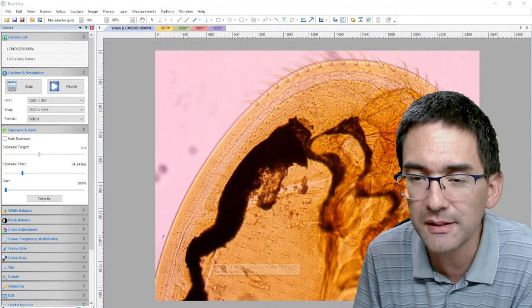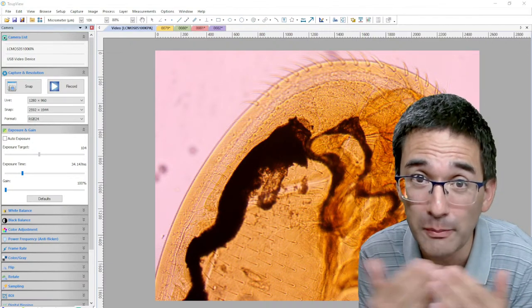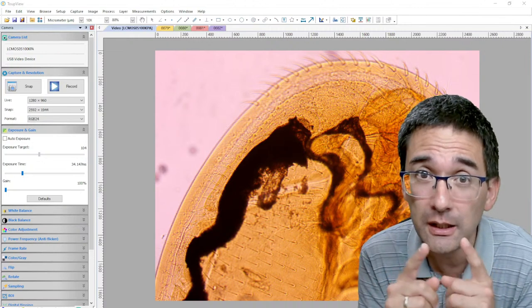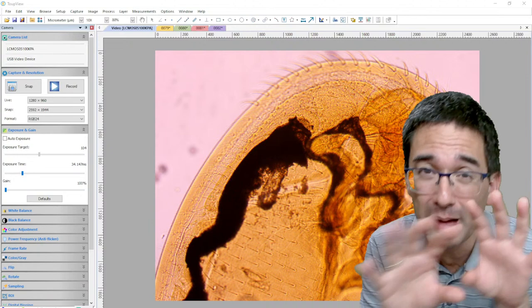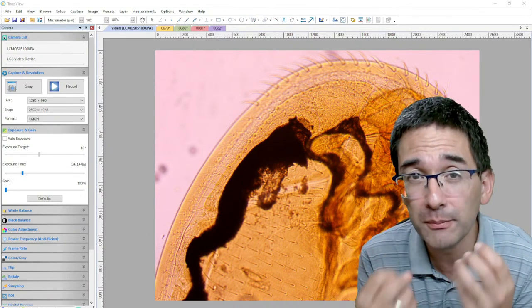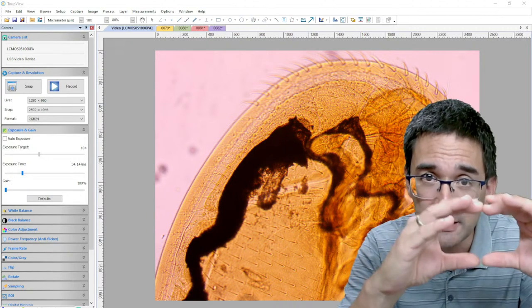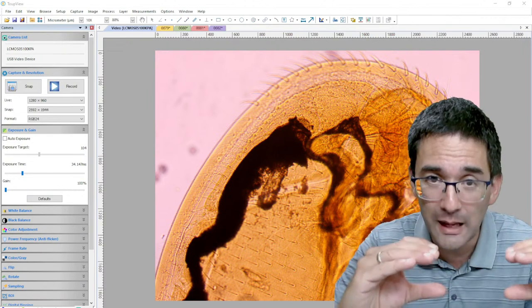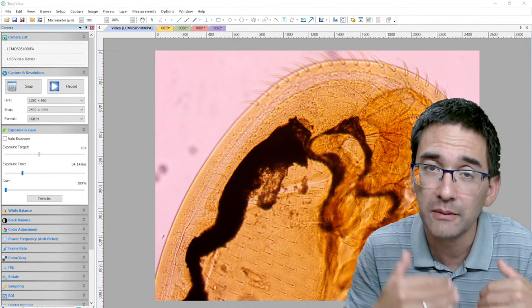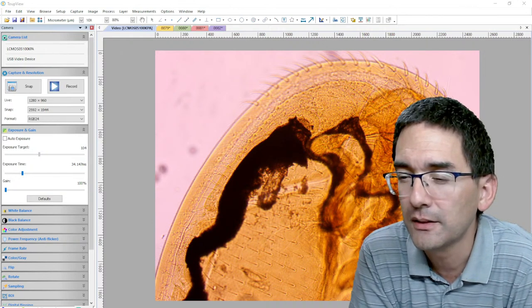I tried doing this stitching with very large images as well. Sometimes this can result in very long calculation times, and sometimes it's not able to match them, especially if there is not a lot of image content, lots of background and so on. So what I've sometimes found useful is to stitch them together in rows. You stitch, I don't know, 5-6 images together in a row, and then you have your overlapping rows, and you try to stitch those together again as a second step.